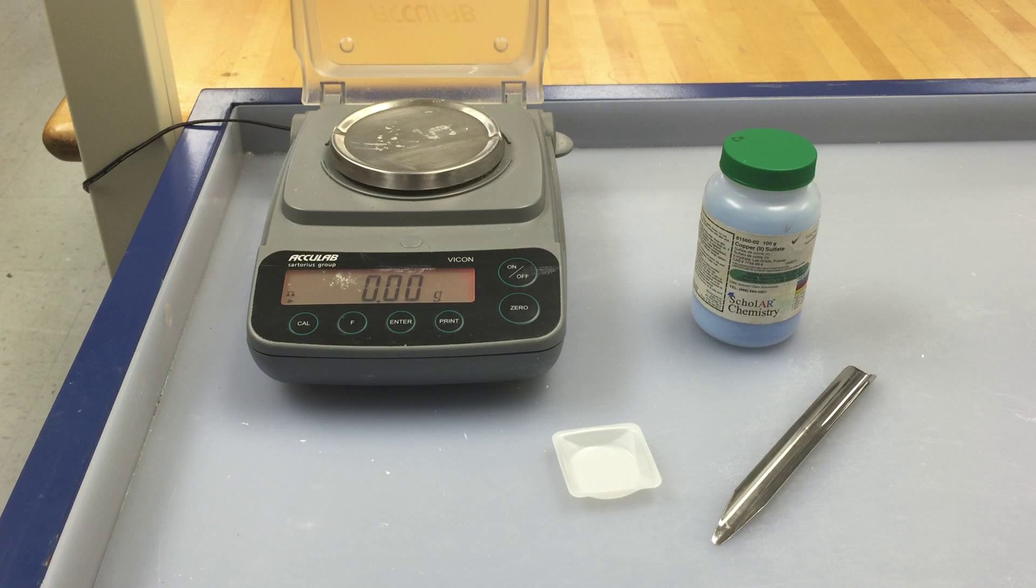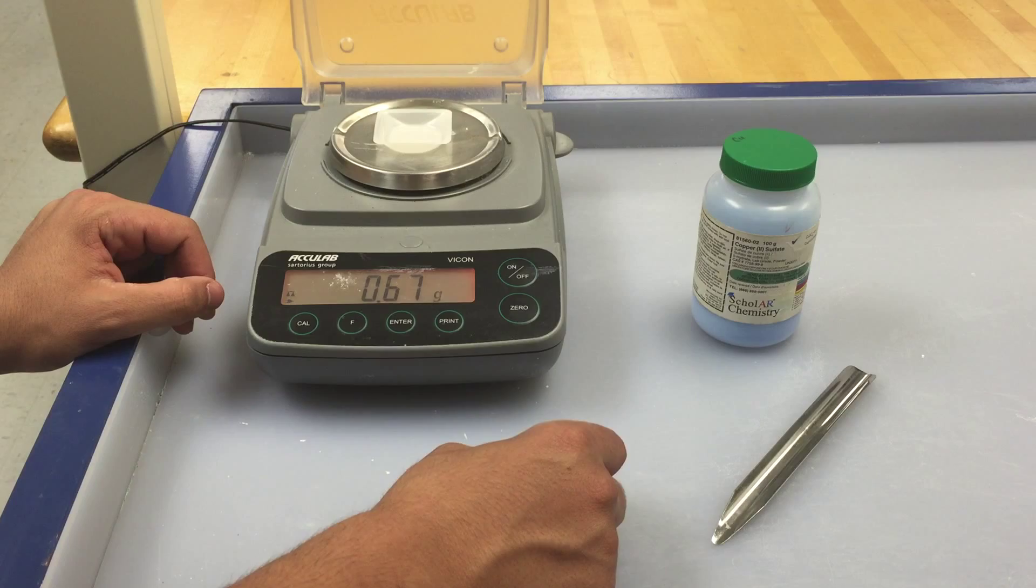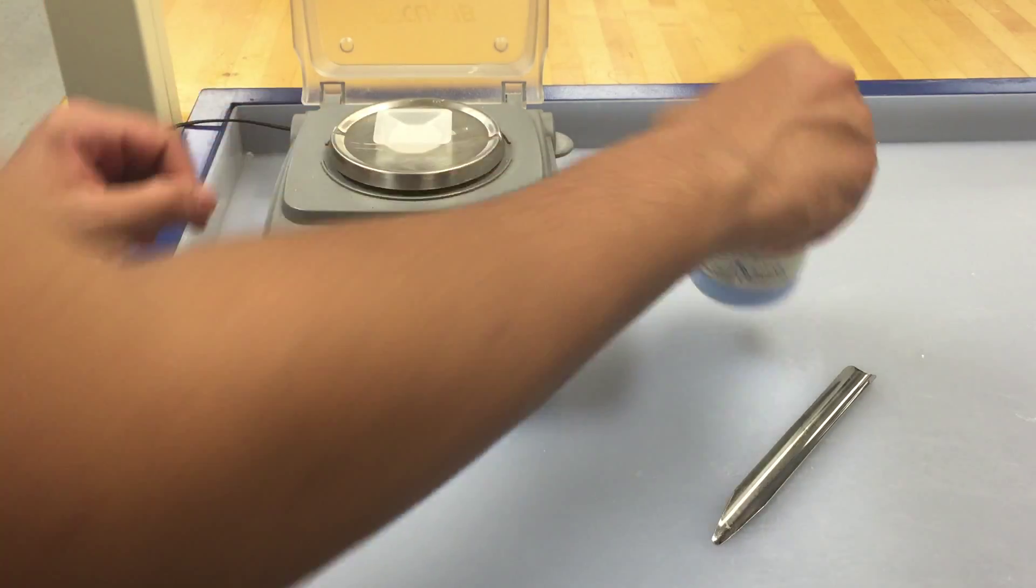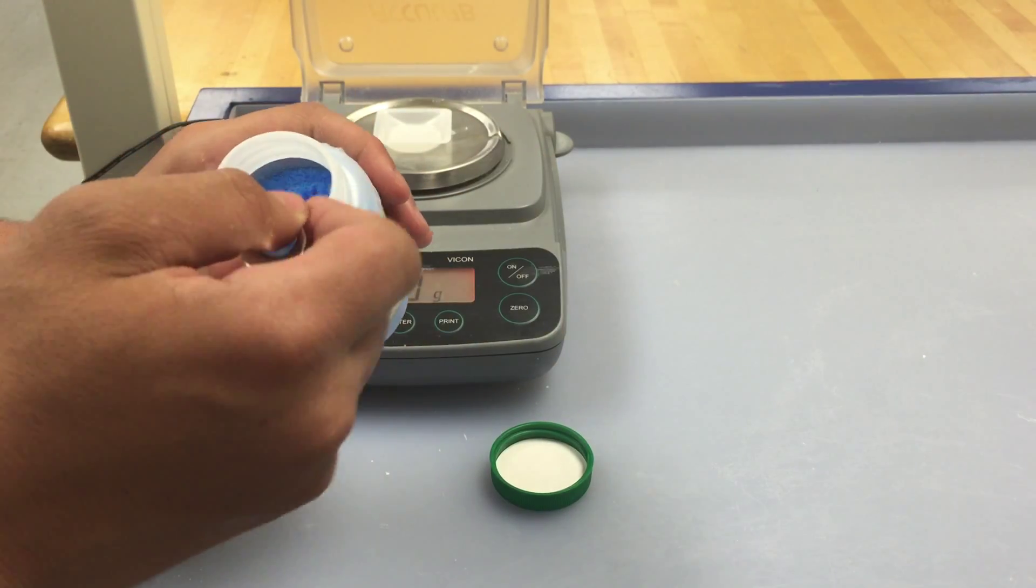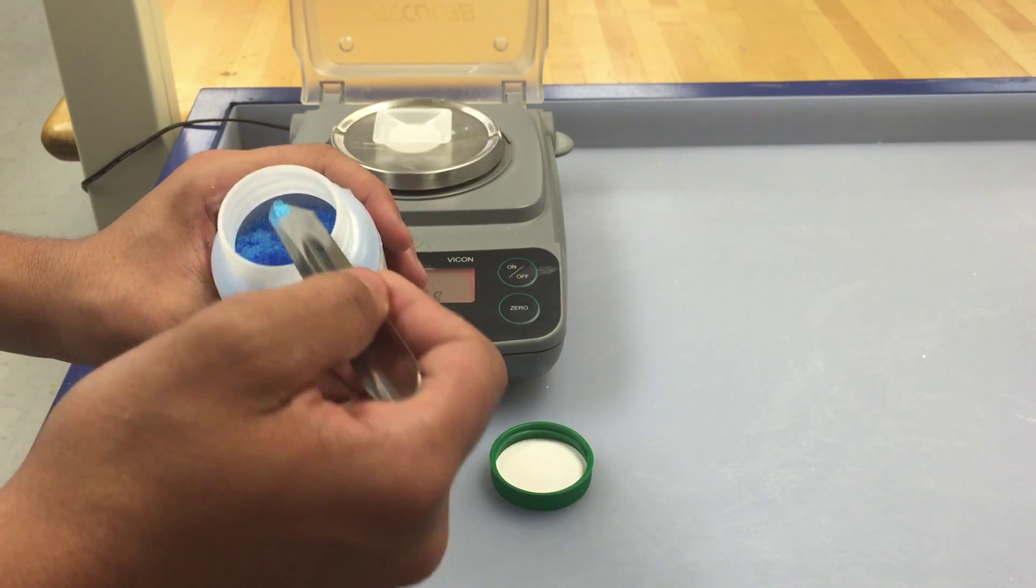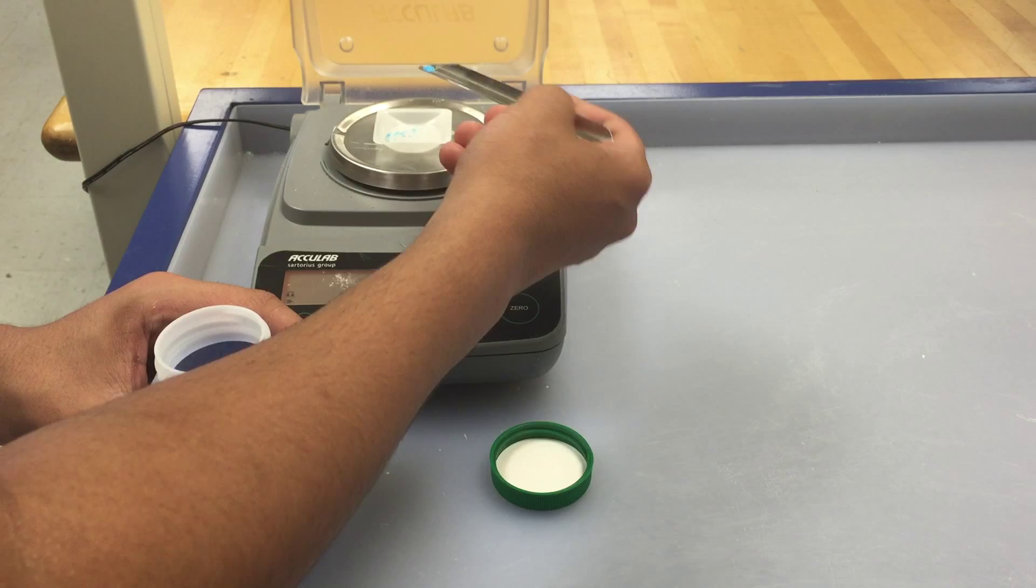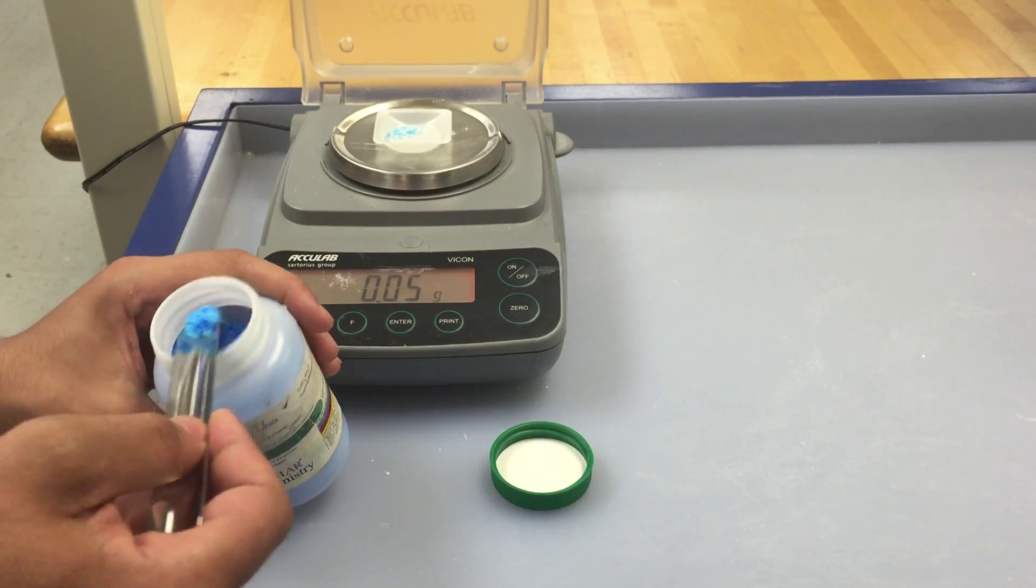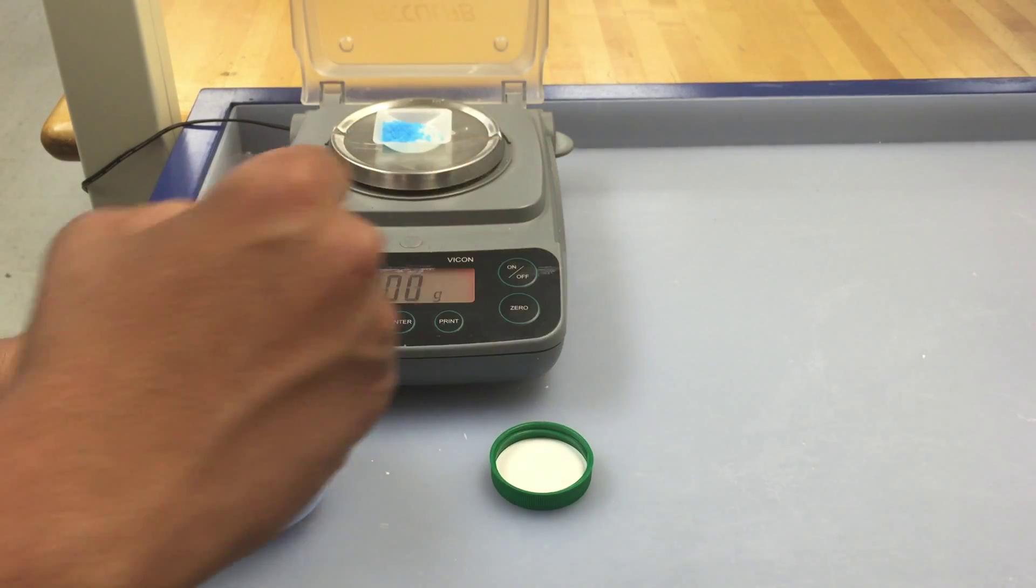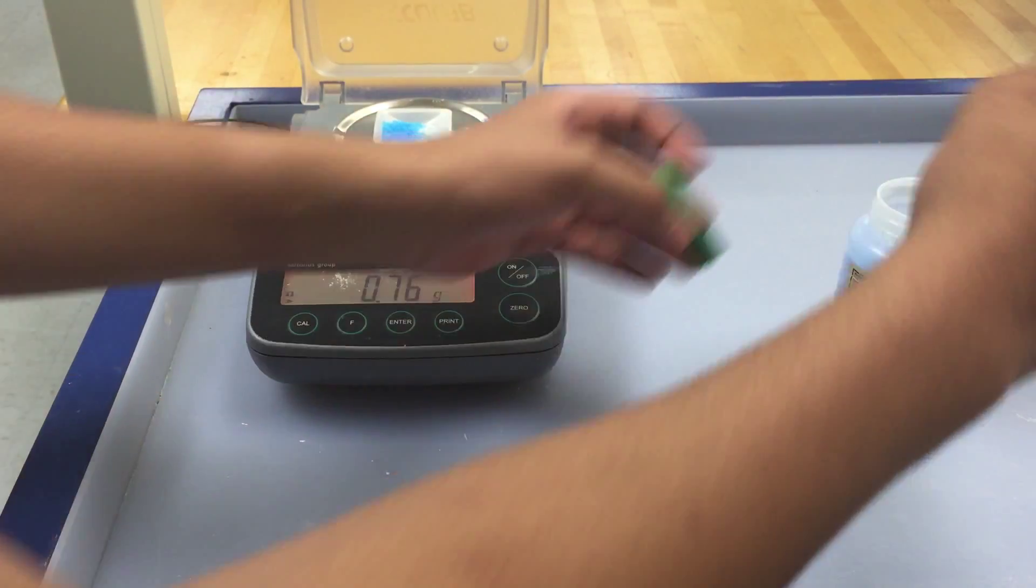To prepare a solution, first you need a balance, a weighboat, a solid substance, and a scupula. Take the weighboat and put it on the balance. Make sure to tare it, which is setting the balance to zero, so that you can accurately measure how much solid substance you're using. In this case, our solid is copper sulfate. Use the scupula to transfer your solid onto the weighboat. Try not to spill any of the solid onto the actual balance, because then the measurement will be off. When you're done, record the amount and close the bottle.